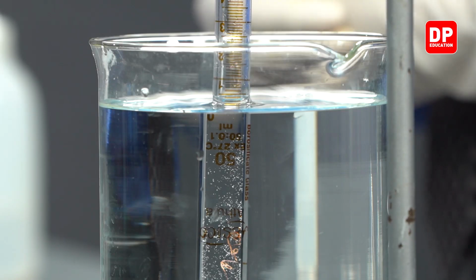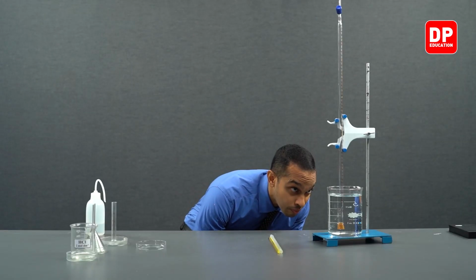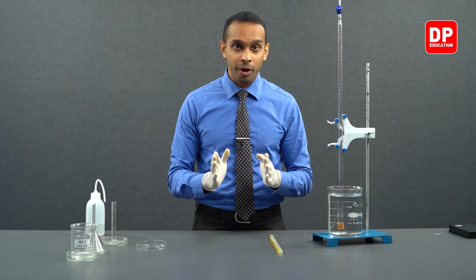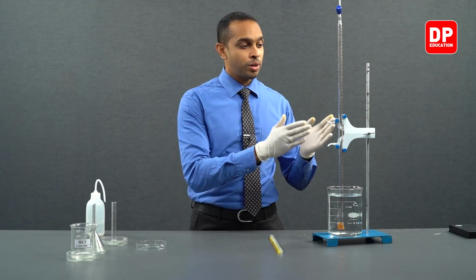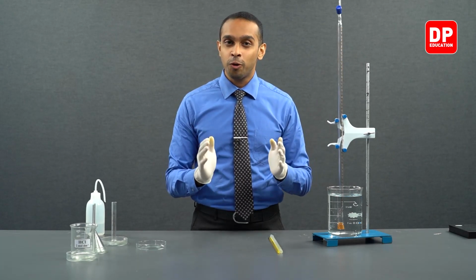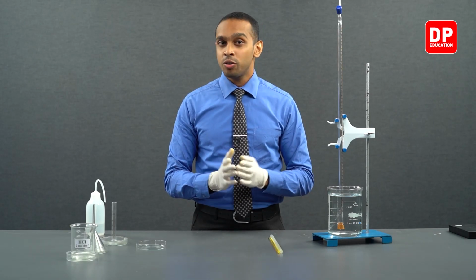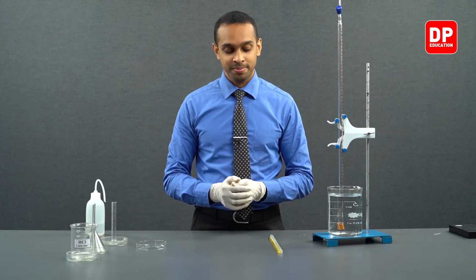Let's take a look at the reading at this point. The reading at this point is 0.2 cubic centimeters, meaning the amount of hydrogen gas collected in this burette is 49.8 cubic centimeters. With that information, we need to take one more measurement, that is the temperature reading.